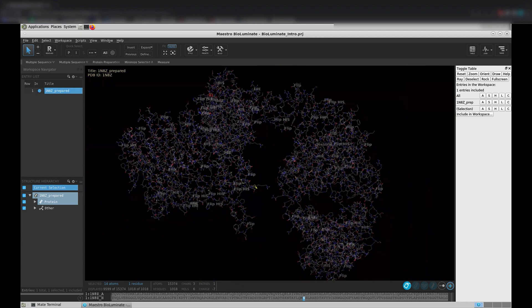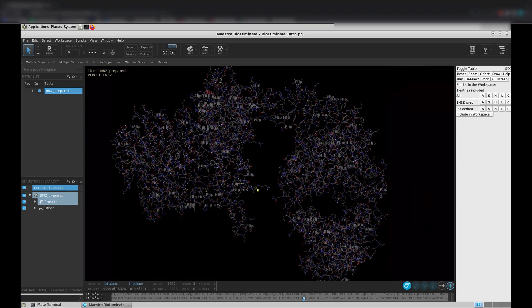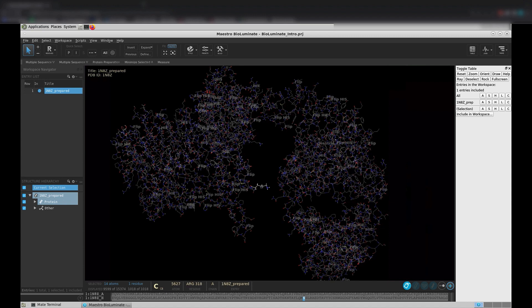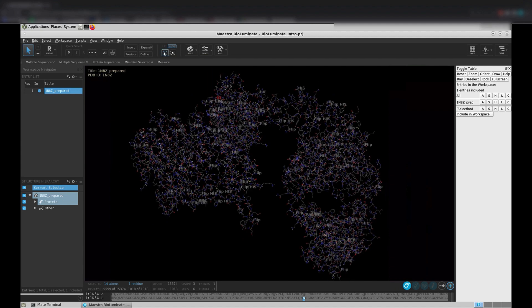Zoom out a bit. Now that we have gotten familiar with our mouse actions, let's look at other ways we can zoom. Let's say you somehow lose where your protein structure is. In this case, you can click Fit View to fit all included atoms to your workspace.